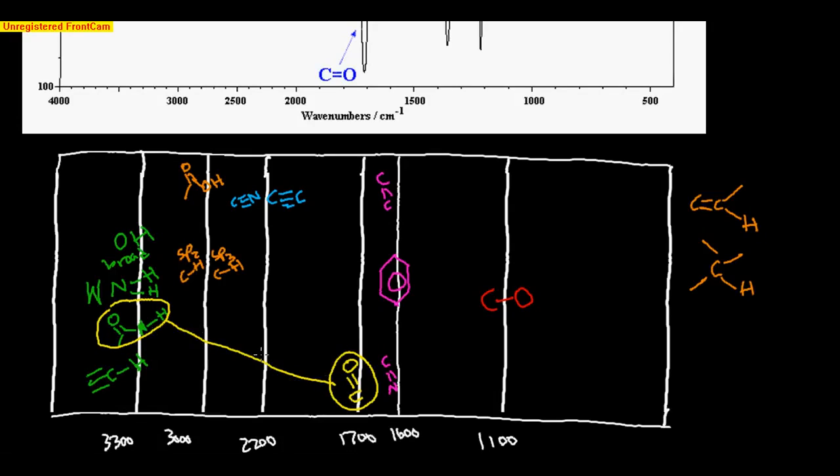So look for these two together. In the same token, if you have an alkene, then you also know there will be a peak for the sp2 hybridized proton. If you have a carboxylic acid, same thing. You will also have the carbonyl.